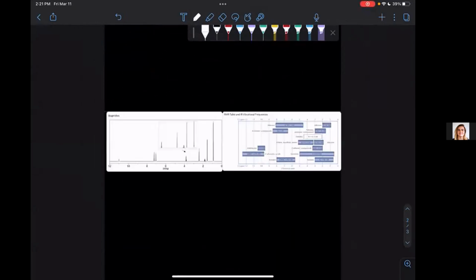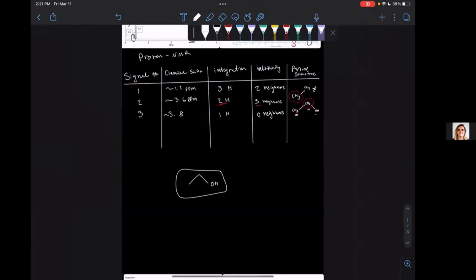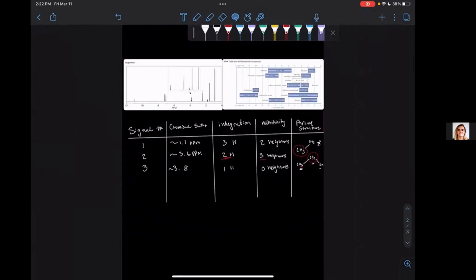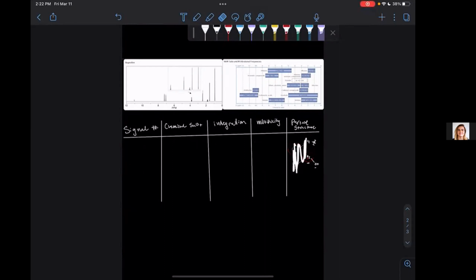We're going to go ahead and get a little bit more complicated right here. So I'm just going to copy this table really quickly. And don't worry, I'll delete everything from it because we have to start fresh. So we're going to paste, move it to where I like it. That looks good. And I went ahead and erased all of the data from the first table. All right.